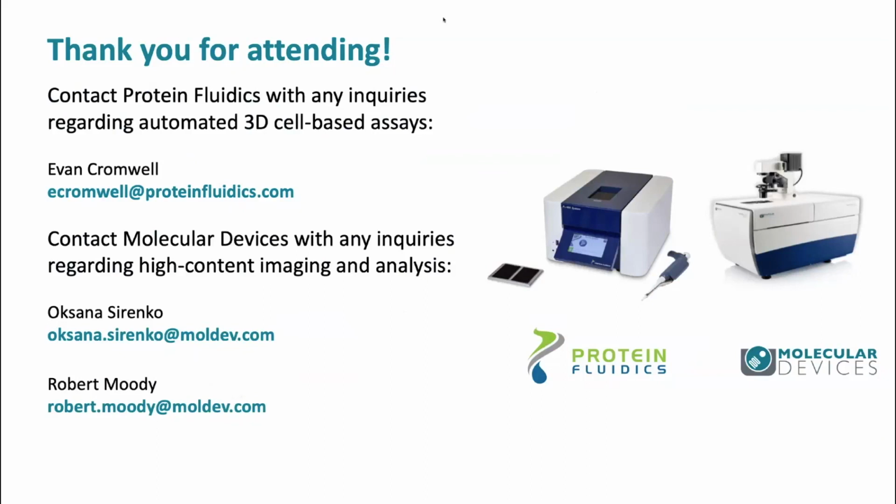So this was actually a very good quality of imaging, and I would say in a flow chip it was comparable to what you have in standard wells, but since we use washed out Matrigel, we get even better quality of imaging.